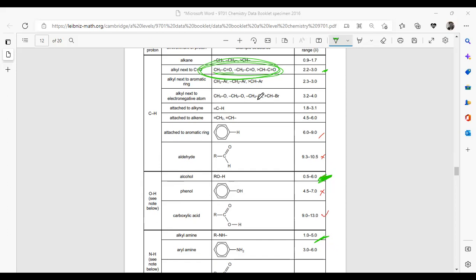Before finding that, we have to see how many hydrogen atoms are there. Now, is it possible to find how many hydrogen atoms are there? Might be, but with these multiplets, it's not clear how many hydrogen atoms are there because we don't know how many peaks are here. For distinguishable peaks that's possible, but from this multiplet it's not possible. There comes the molecular ion peak value. In such situations, they will give such values. Now, how can we find this?